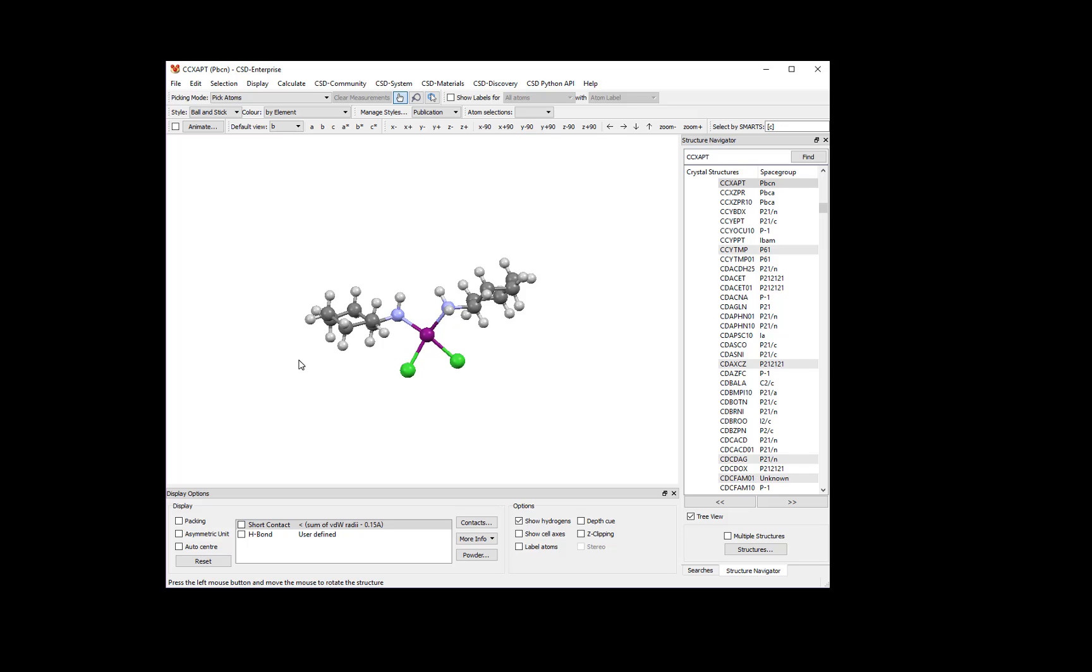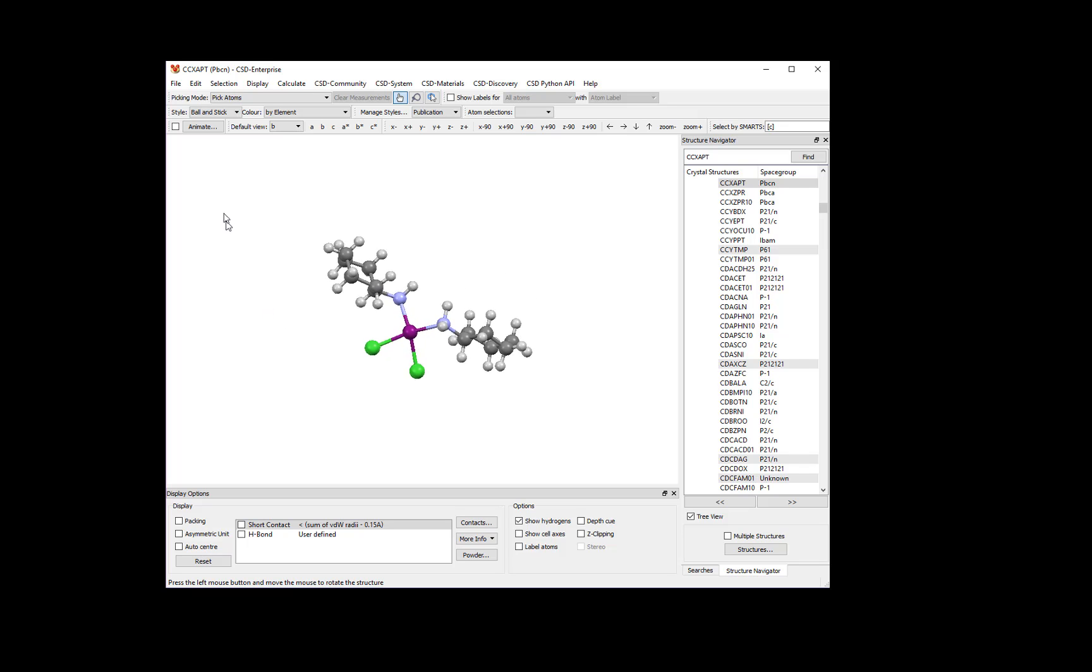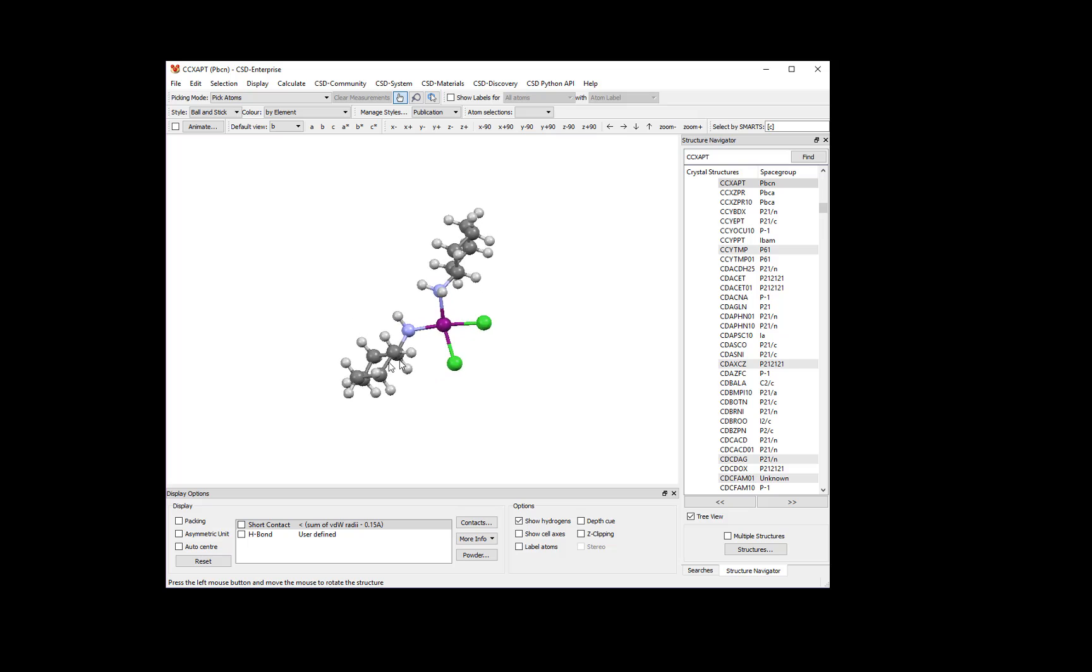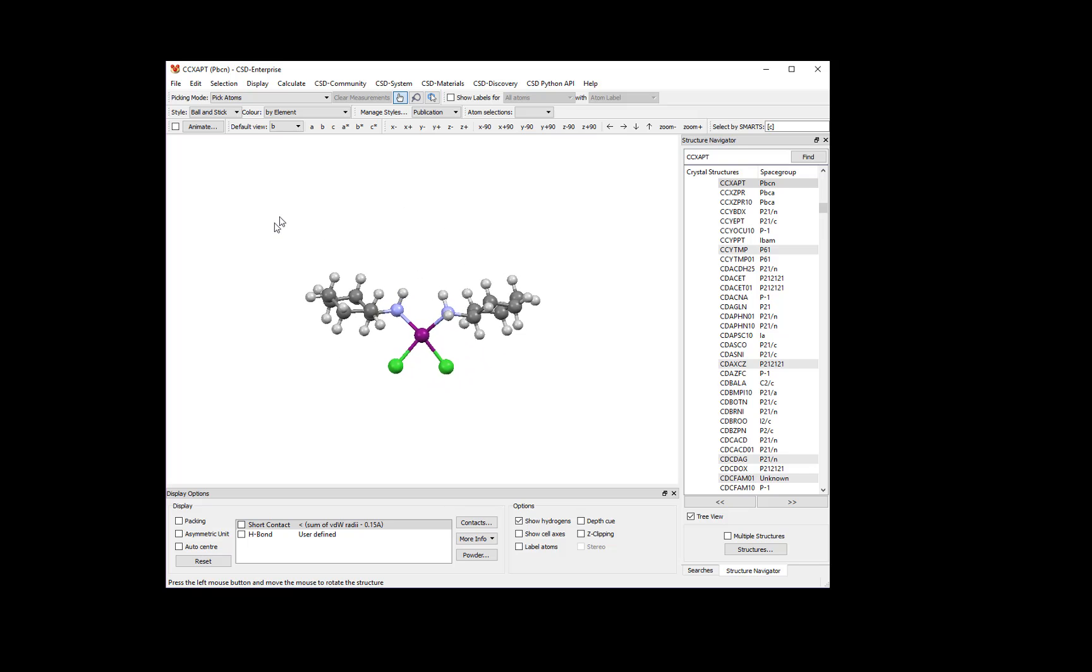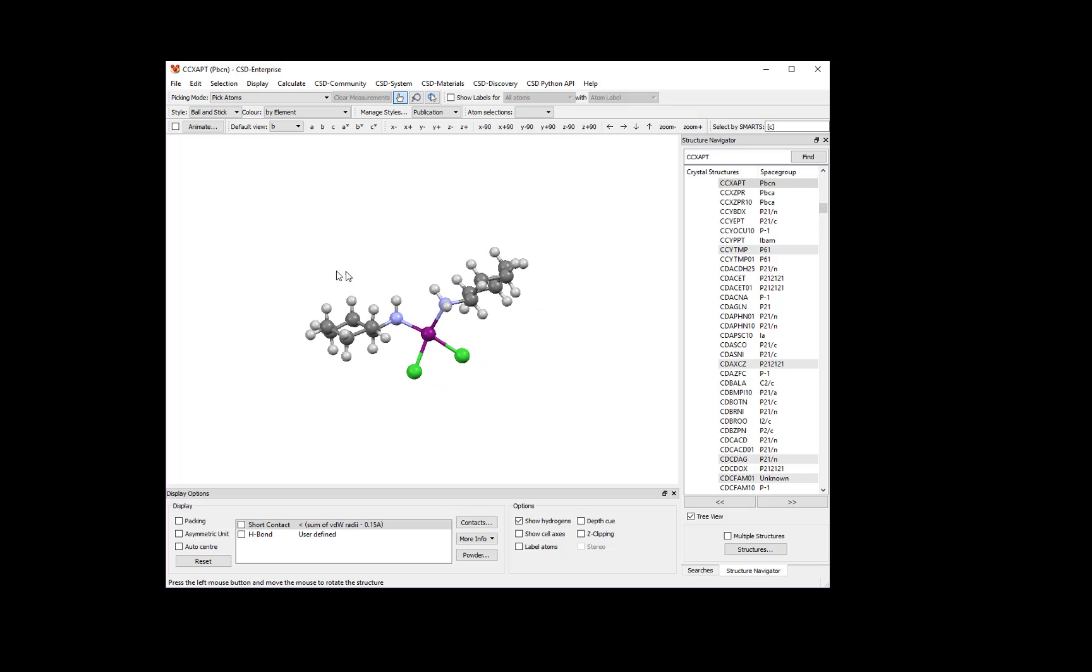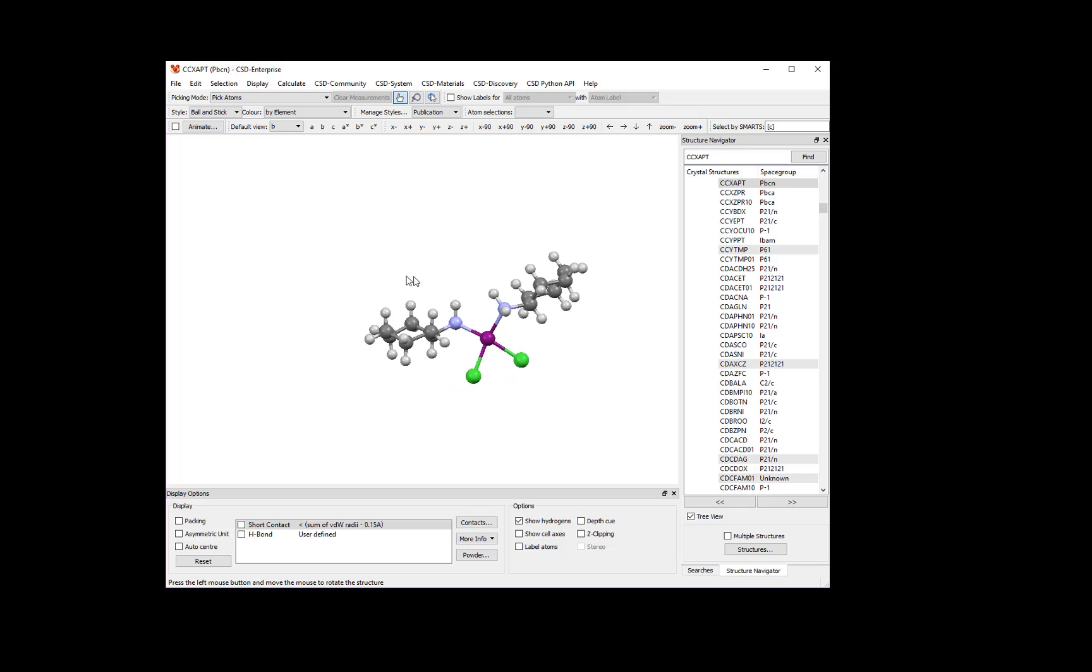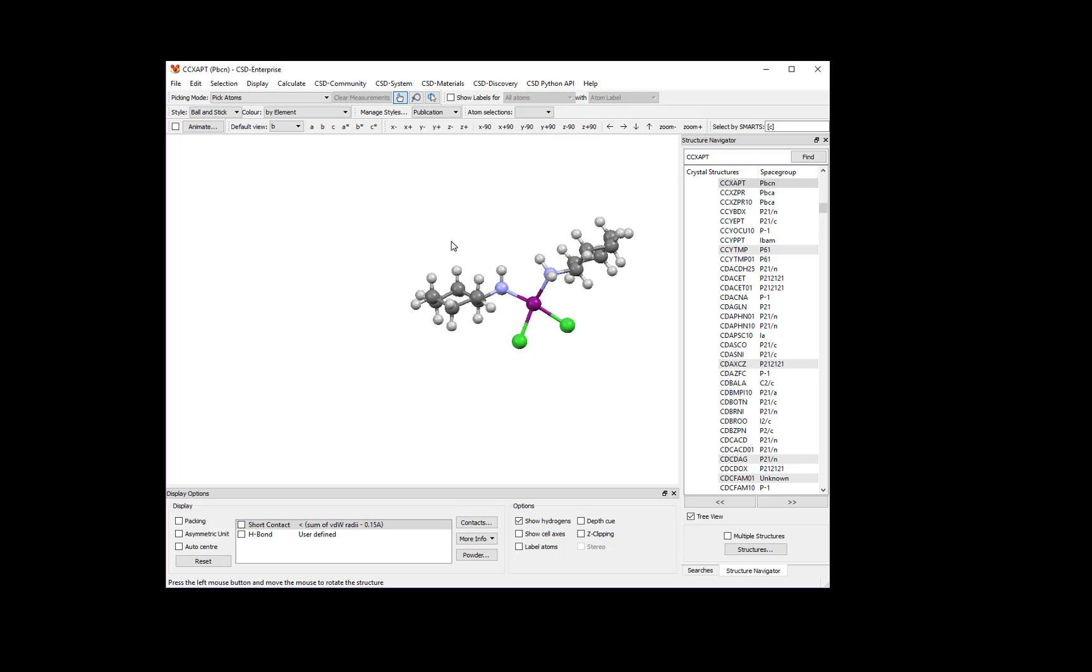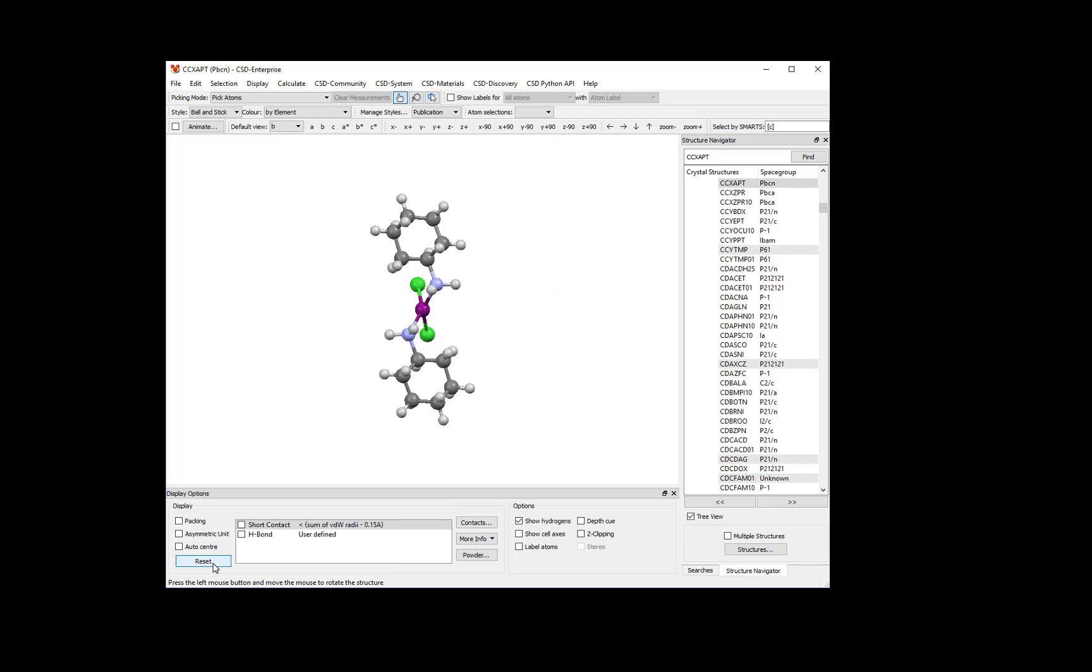In addition to simple rotation, you can use Shift-click and drag to rotate the molecule in the plane of the screen, or Control-click and drag to translate the molecule in the plane of the screen. At any time, you can press the Reset button to return to the original orientation.